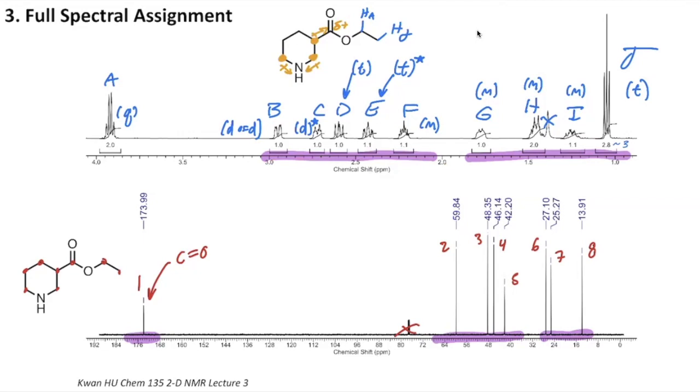If I were you working on this problem, I would just go ahead and take this pretty literally, at face value, to say, I'm going to take the positions that are next to the most withdrawing functional groups and then just fill those protons in order. And then we'll take a look at them afterward with a little bit of splitting analysis to see if the number of neighbors based on their perceived splitting makes sense with the assignments that we've put in place. So let's get rid of these orange annotations here and start filling in some proton identities.